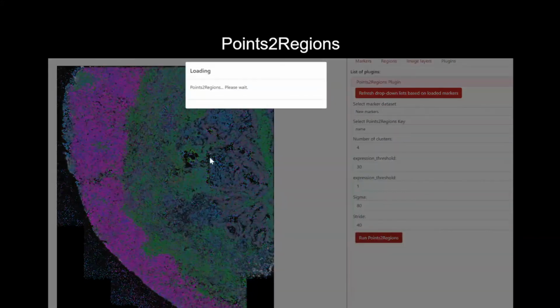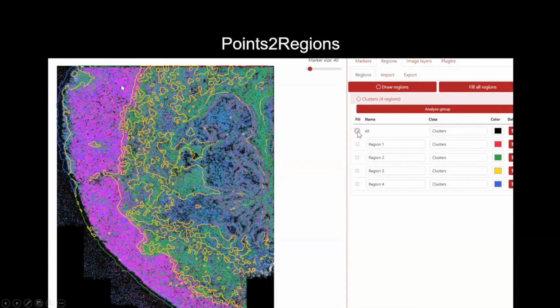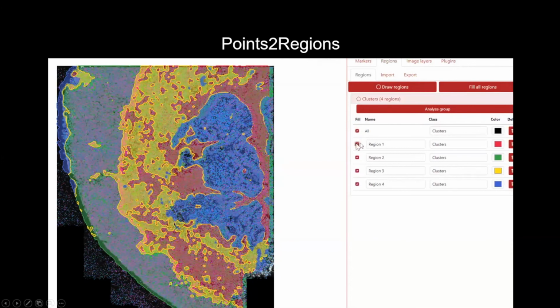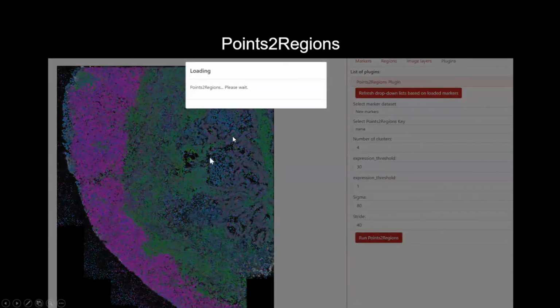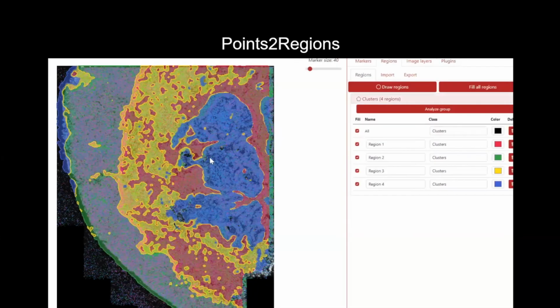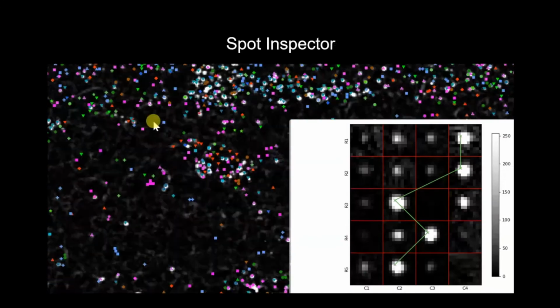And then we have a small plugin that was developed by Axel Andersson here at the lab, where you take in situ sequencing data, for example, as input, where you have embedded vectors for each spot, and then you can create targets from each point, and then you can create automatically a number of regions that will cluster your points depending on local information. That's an example, of course, but you could think of any other kind of plugins that you could develop or contribute to.